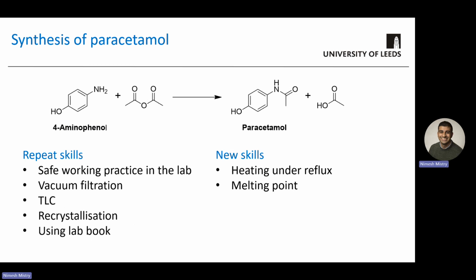Okay, so this is the briefing video for the paracetamol experiment, and what I'll do is give you an overview of what you're doing in the experiment, why you're doing it, and key bits about the timing and planning of the experiment, and tips for how to perform the experiment safely as well.